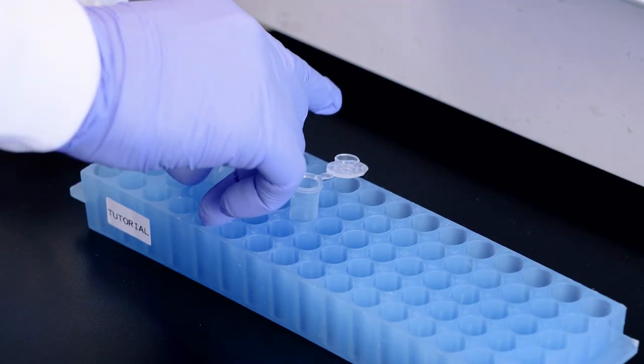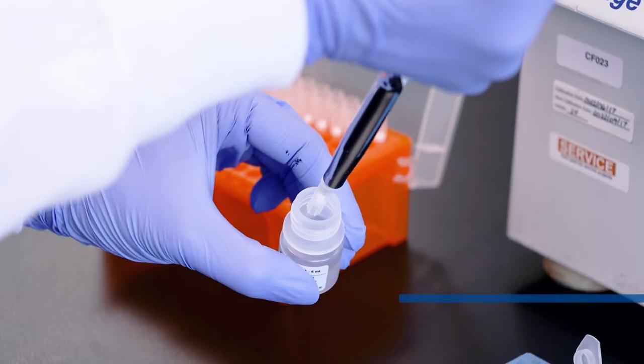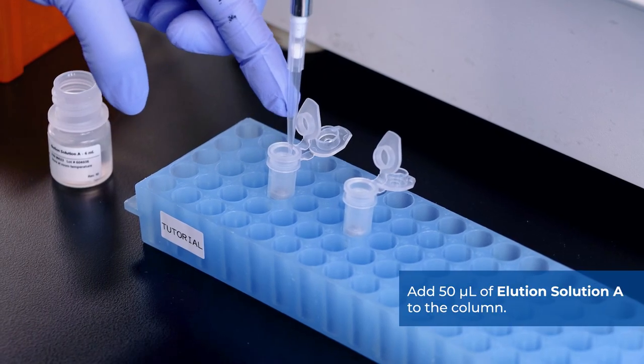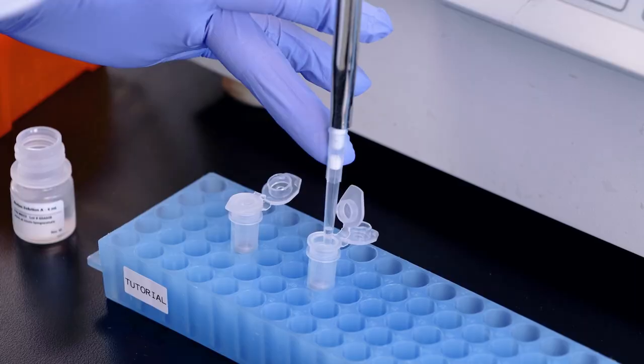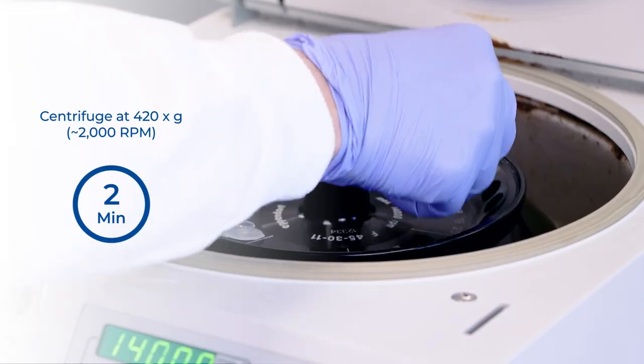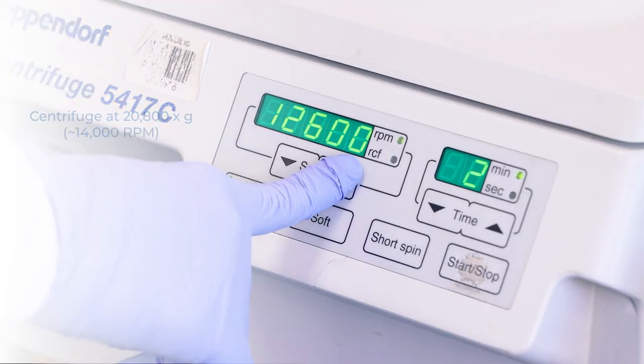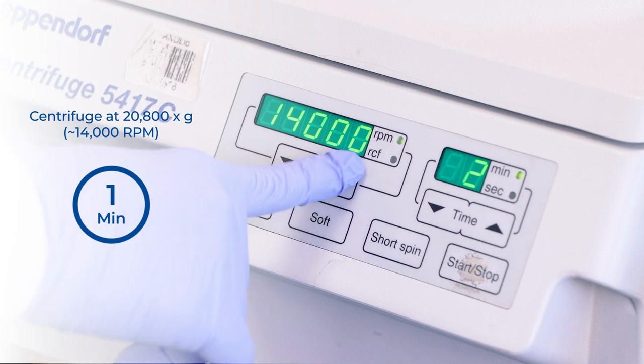Place the column into a fresh 1.7 milliliter elution tube provided with the kit. Add 50 microliters of elution solution A to the column. Centrifuge for 2 minutes at 2,000 RPM, followed by 1 minute at 14,000 RPM.